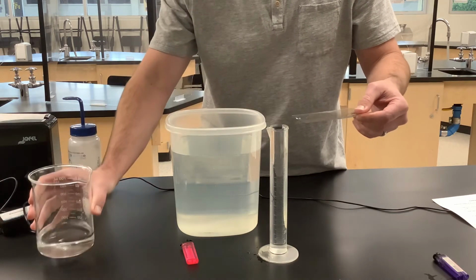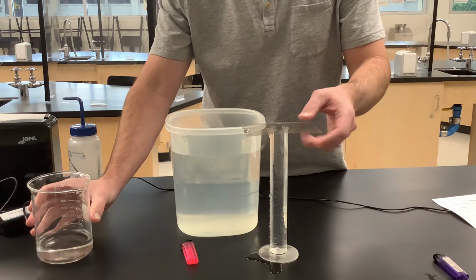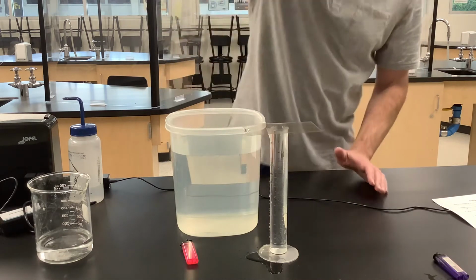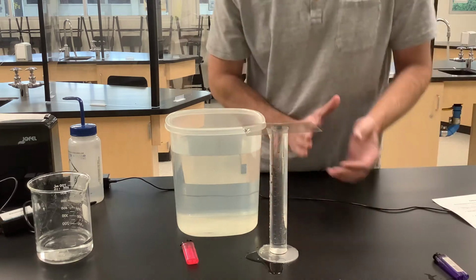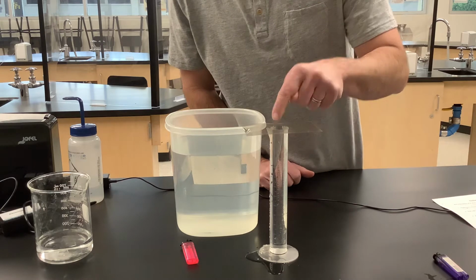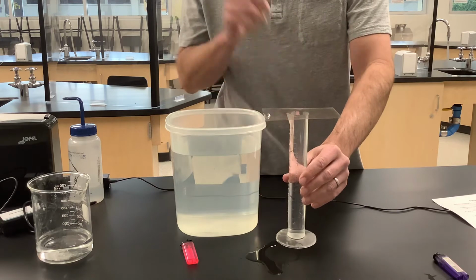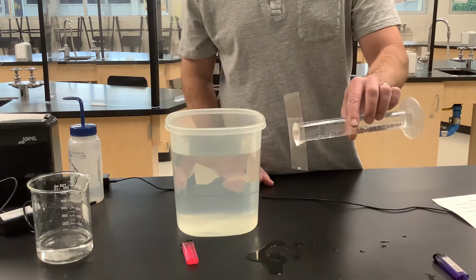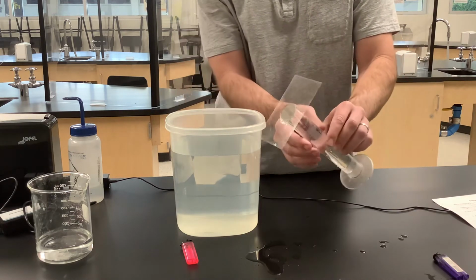We'll put a little bit more in. I'm going to slide this little thing on here. We make a bit of a mess, but that's okay. Now, what's cool about this is that there's atmosphere pushing down on top of this plastic, and atmosphere pushing all around the cylinder, but there is no atmosphere between the plastic and the water inside the cylinder. Remember I told you that the atmosphere is crazy strong. At this point, the atmosphere will hold the plastic on there for me, and I don't have to worry about it spilling or dripping out.